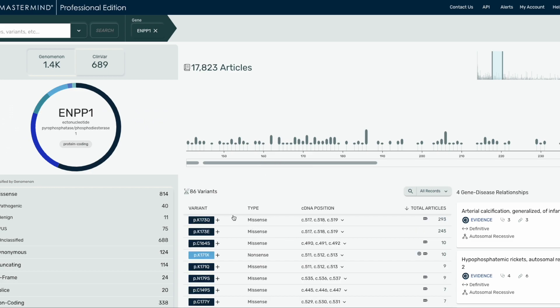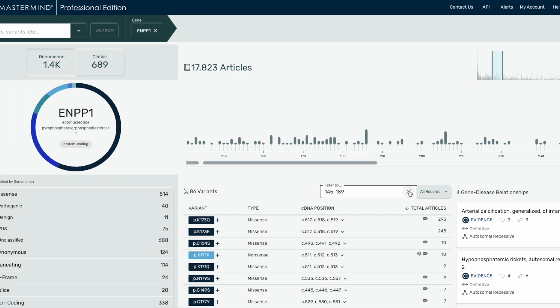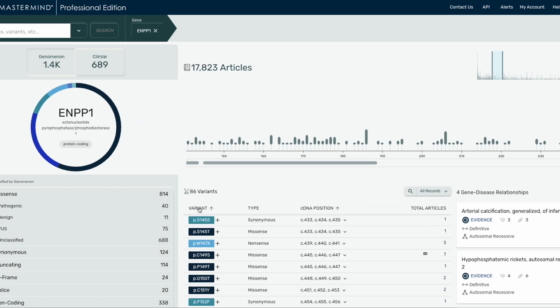The variant list here describes the variant, variant type, cDNA position, and total number of articles, along with icons indicating whether a Genomenon or ClinVar classification is present for that variant. We've added the ability to search for any amino acid position range in the search bar of the variant table — for example, 50 to 100. From here, you can then sort by position or sort by most studied variants in the range.